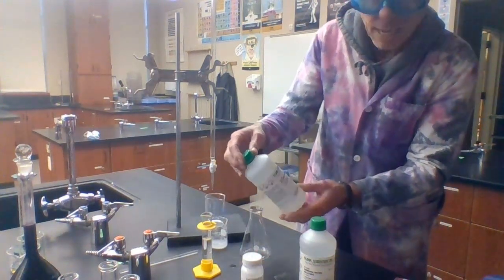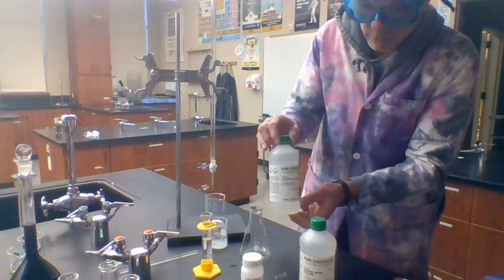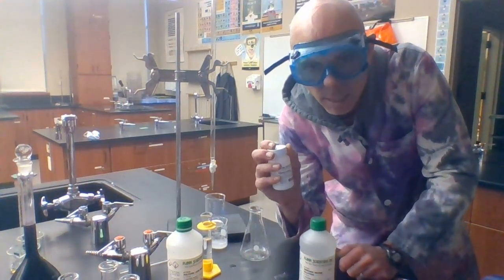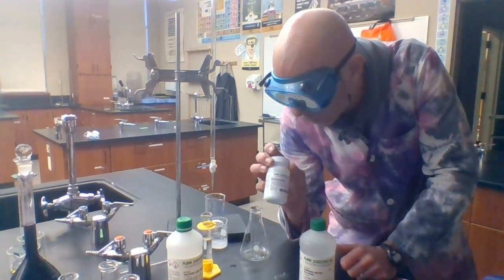I've got sulfuric acid here. This is a strong acid, very toxic, very corrosive, and it's of a high concentration, so we've got to be careful with that. This is phenolphthalein, which is an indicator — a pH indicator that indicates when the pH of a solution is either basic or acidic. I'll talk about how it works in a moment.